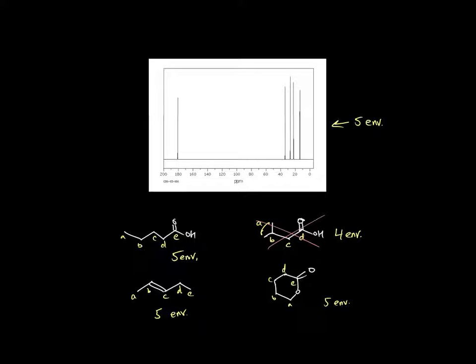All right, so let's look at what we have up here in terms of chemical shift, because that'll let us sort it out. That's the other thing we can consider. This guy has 1 in that carbonyl region. So the carbonyl region is the highest. It's between 160 and 210. So we definitely have a carbon in the carbonyl region, and we have no other carbons that are attached to anything else of any significance.